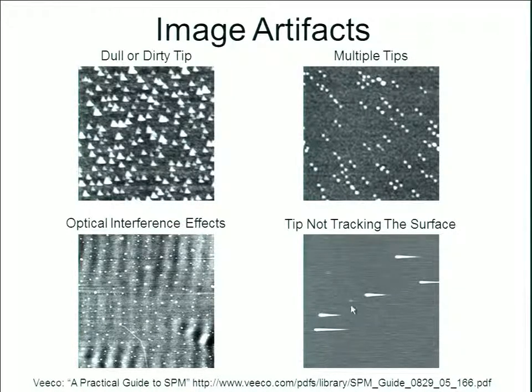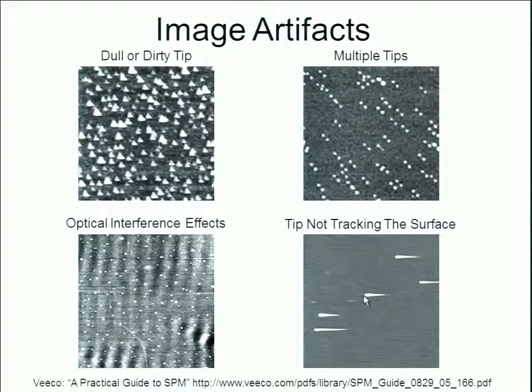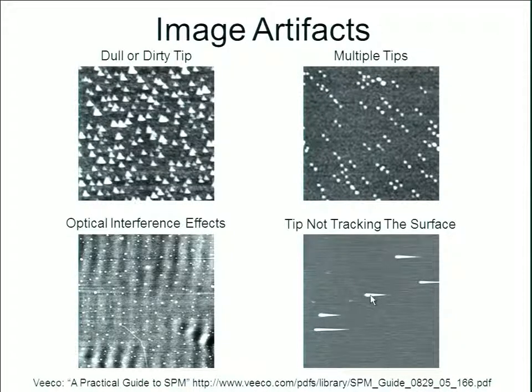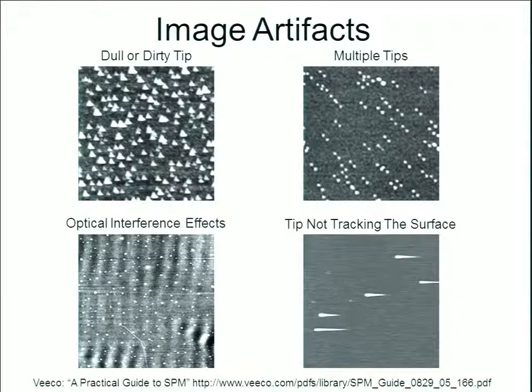In parachuting, since the feedback loop is not set up correctly, as you scan from left to right, your tip does a good job tracking the surface going up the particle. But instead of falling back down quickly on the backside, it takes a long time to return to the surface because the feedback loop is off and you're not maintaining that constant tip-sample interaction. The particle ends up looking like a teardrop shape instead of a sphere.